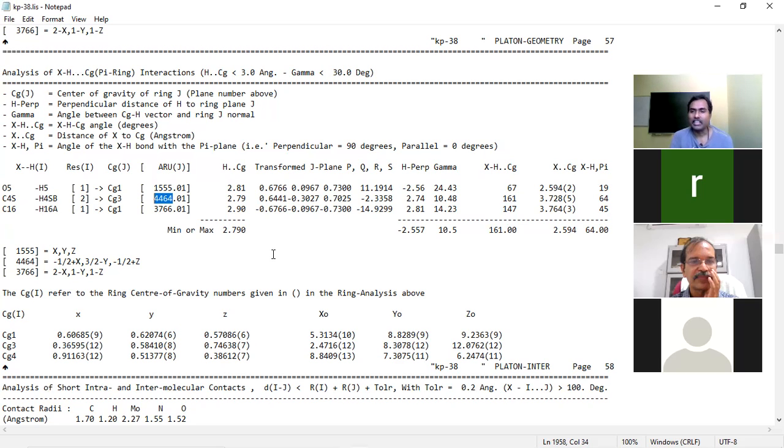Mostly they like this, because it is very significant to show it by drawing a cylinder. So it seems that some kind of interaction is there. It gives a strong, clear picture that it has some interaction. In most cases everyone accepted. Only in a few cases we met with problems, and in those cases we handled it and used dotted lines. Then they accepted. Okay.